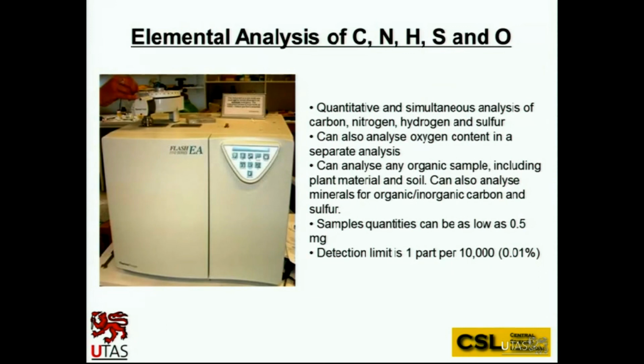Just very quickly, this instrument I also look after has nothing to do with vibrational spectroscopy. It's our organic elemental analyzer for carbon, nitrogen, hydrogen, sulfur analysis. The thing really to point out is that it's a very simple technique to get your high precision carbon, nitrogen, hydrogen, but it does require a qualified operator, and there are really big pitfalls with this sort of instrument. Unless you really know what you're doing, you just get numbers out at the end and you believe them. So it does take quite a bit of knowledge to operate this instrument.